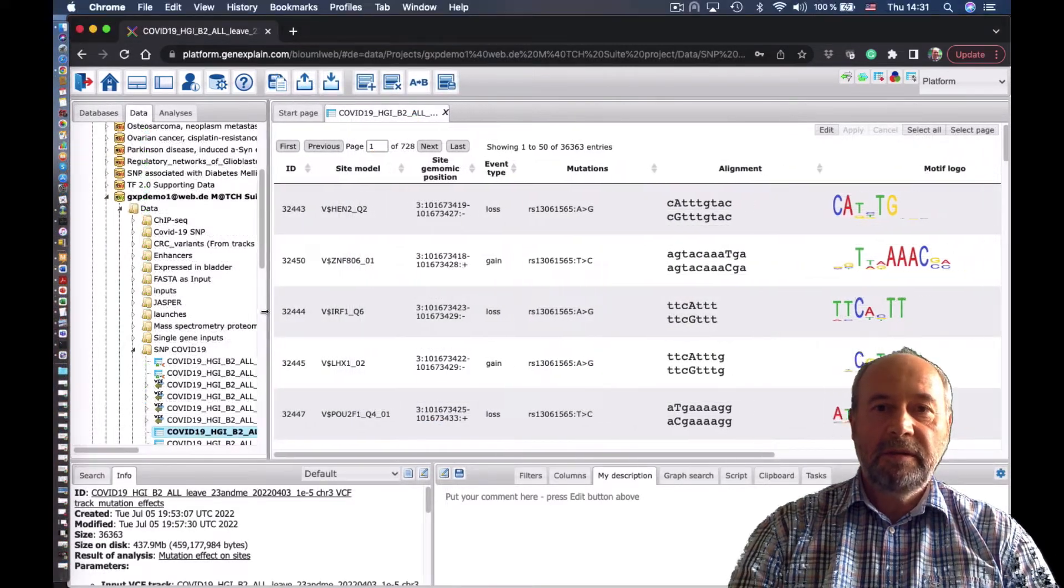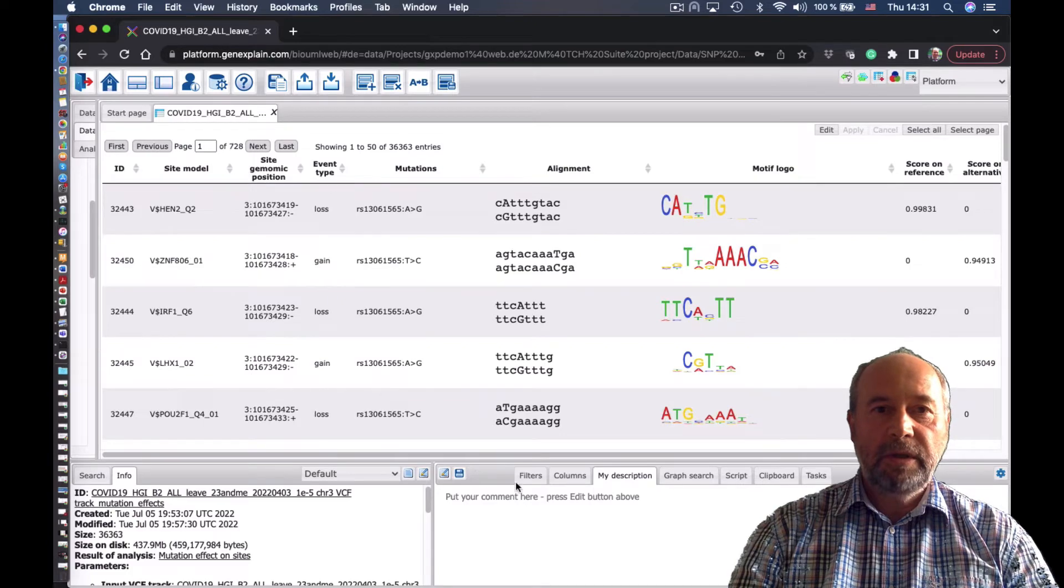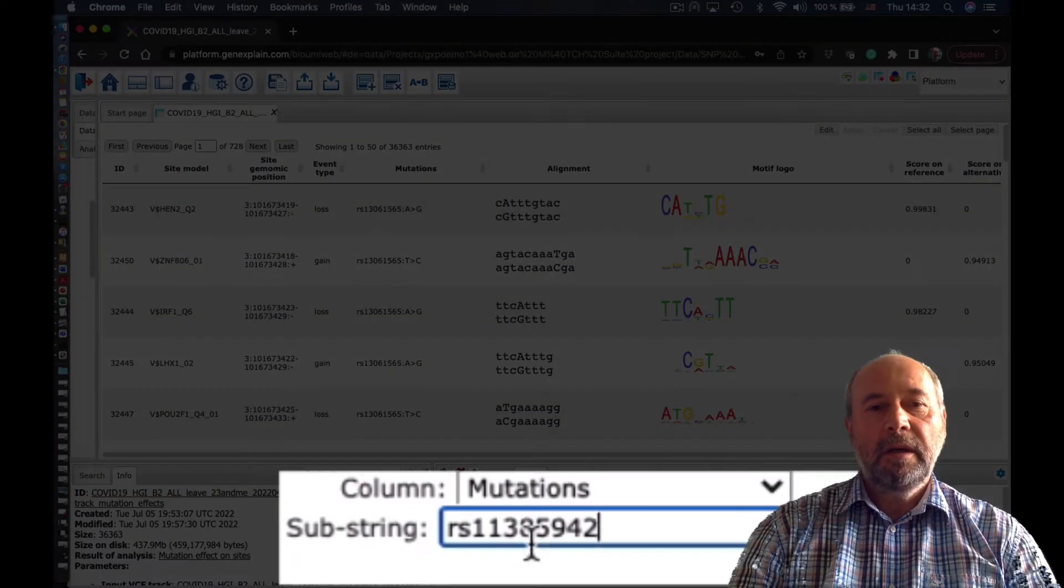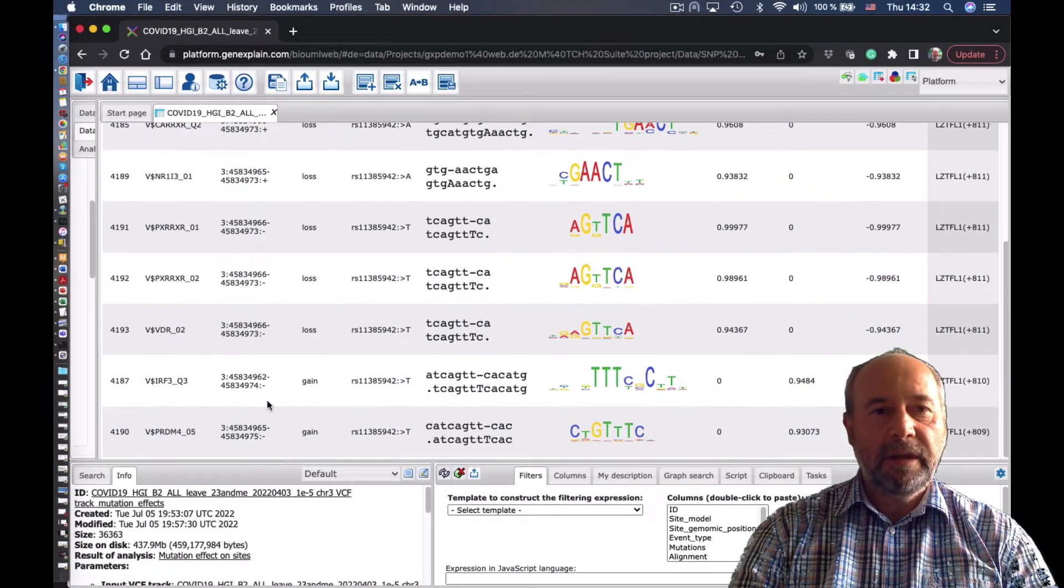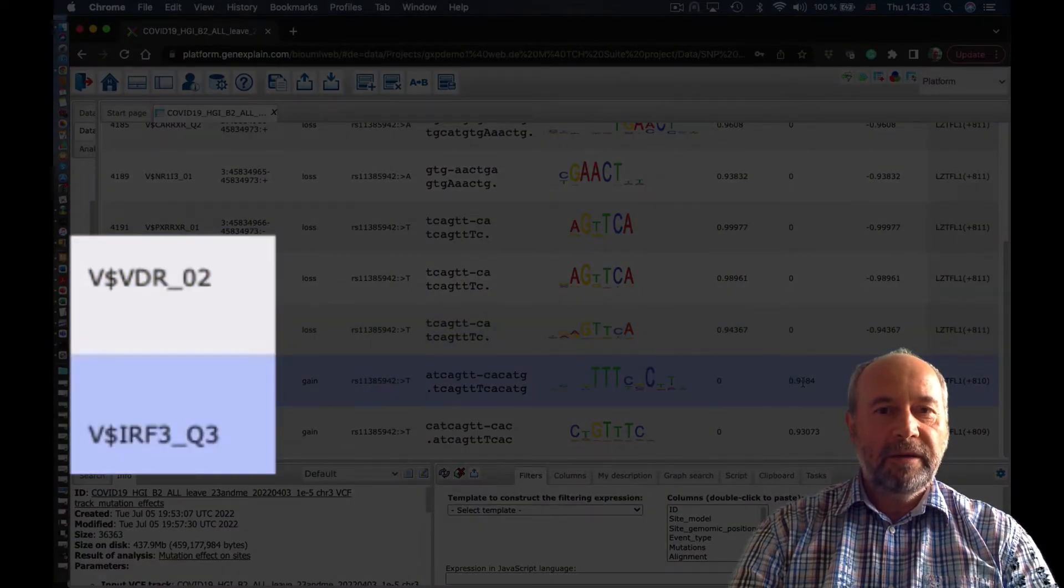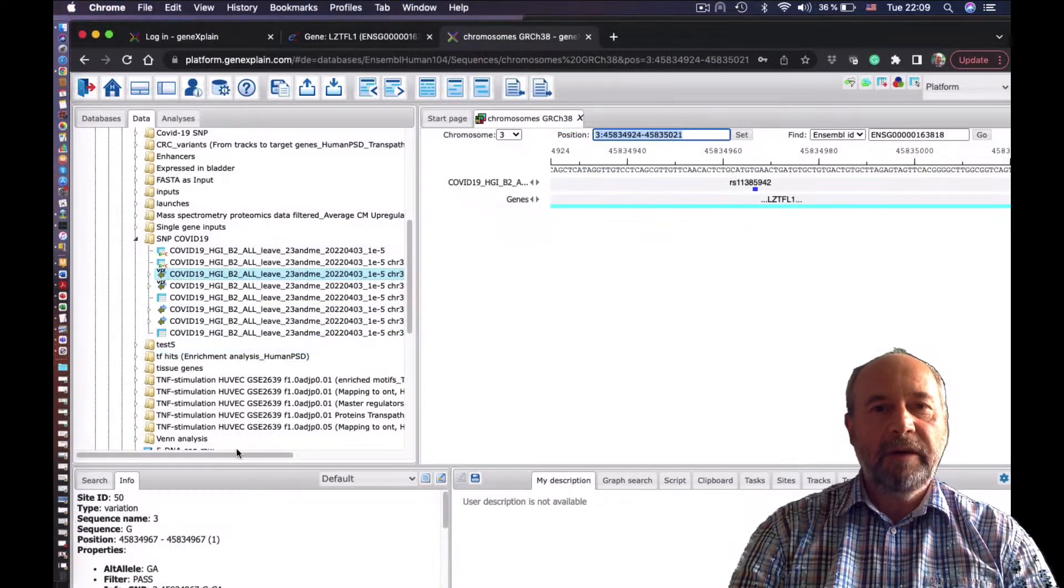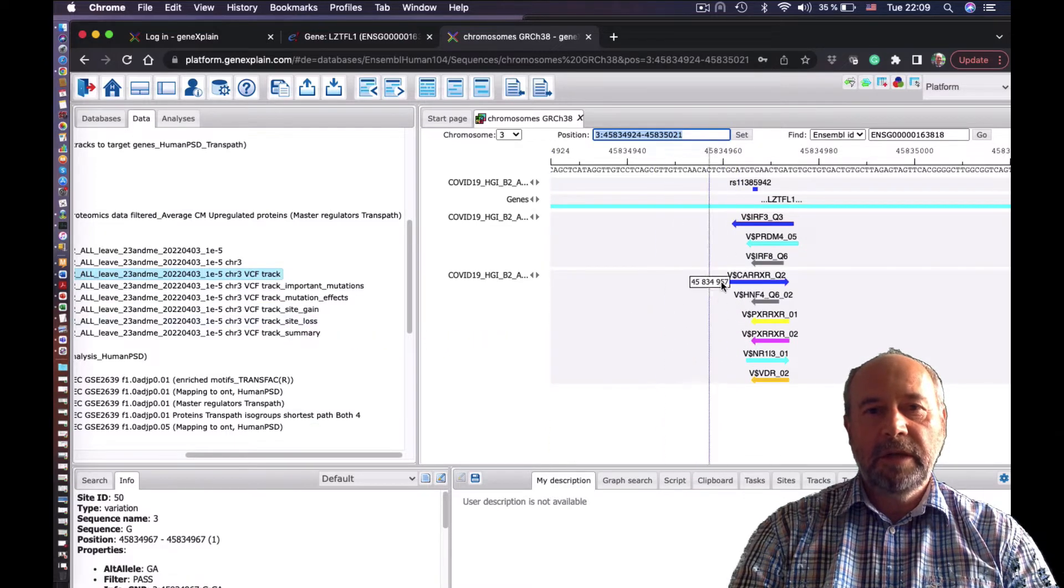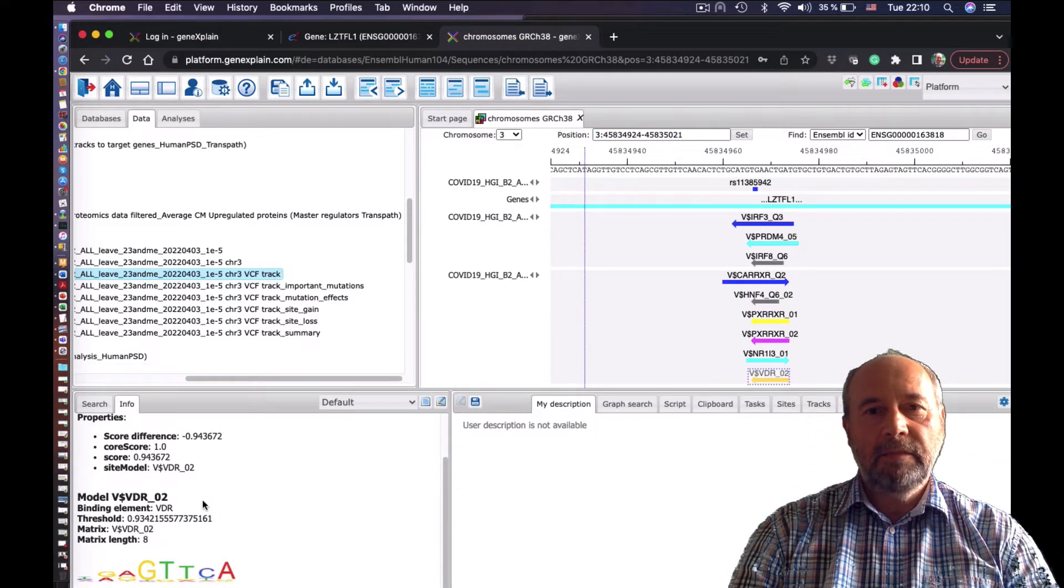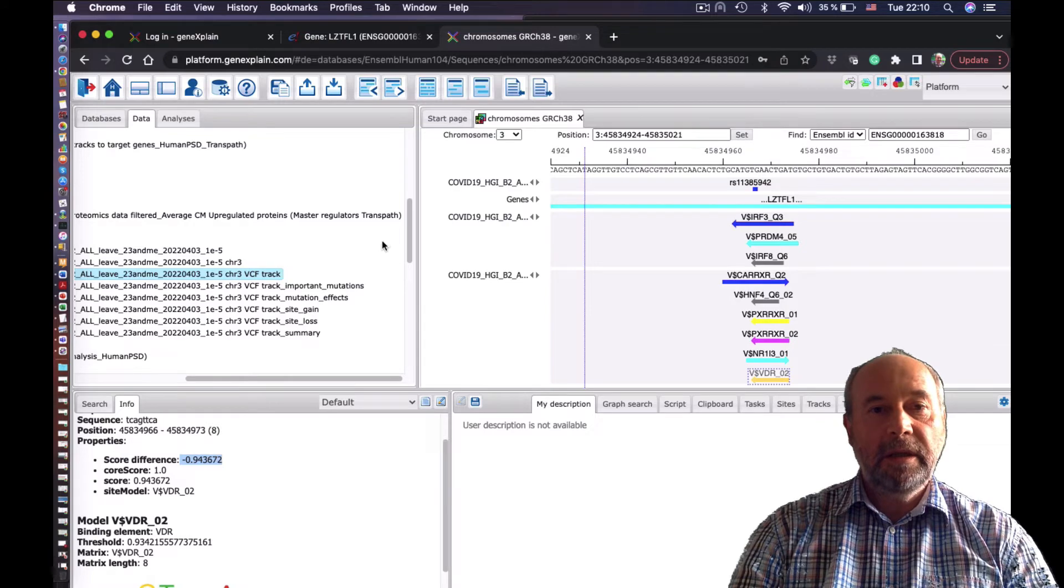Here we see the result. The analysis is ready. It found many binding sites which are affected by those SNPs. Let's have a look at the SNP of our interest. We simply filter that output. And now what we see are two important factors. As you can see, VDR and IRF3. Let's put this information on the genome browser. You see those sites which are gained or lost due to that mutation. And we see that the loss and the gain is very important.